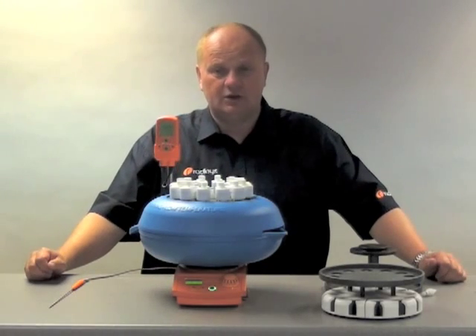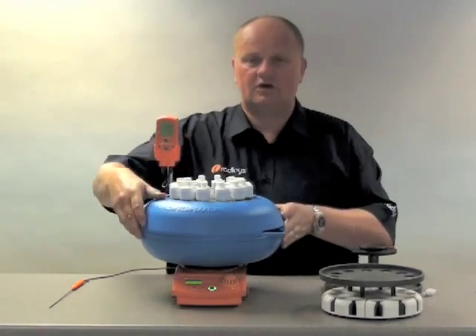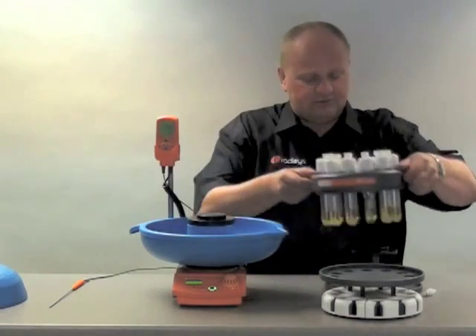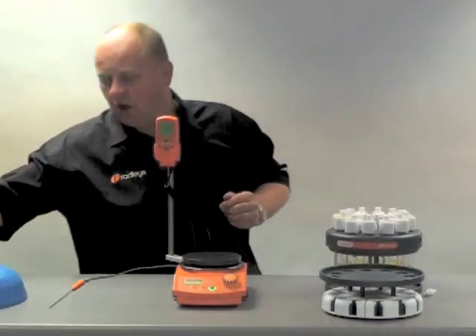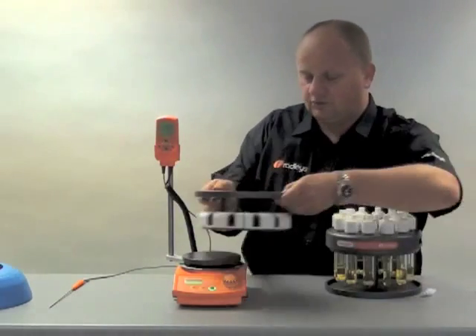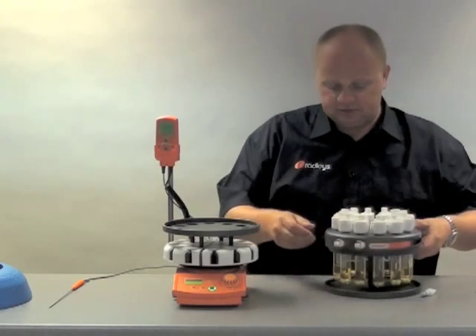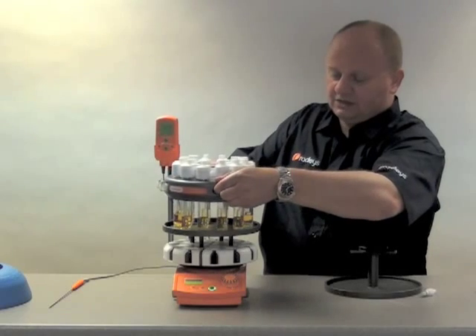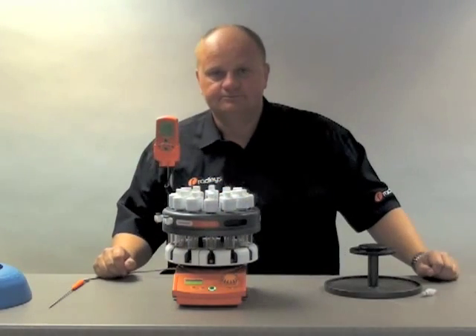So as you can see, with the Carousel we have a truly versatile system that both allows cooling of twelve positions and also, in an instant, you can change the system and have heating. There is no other system in the world that offers such versatility at such an affordable price. And that's why the Carousel has become the most popular low-cost parallel synthesizer in the world, with over 7,000 units sold worldwide. Thanks very much.